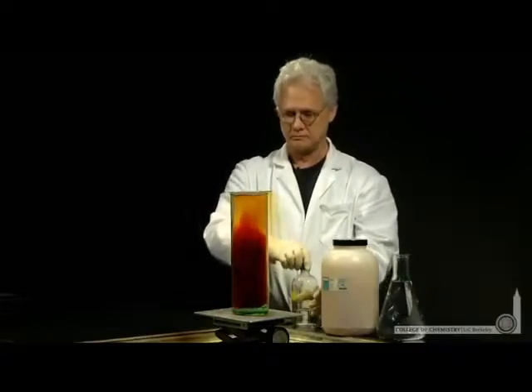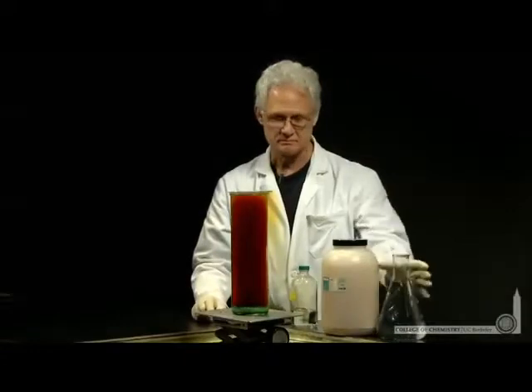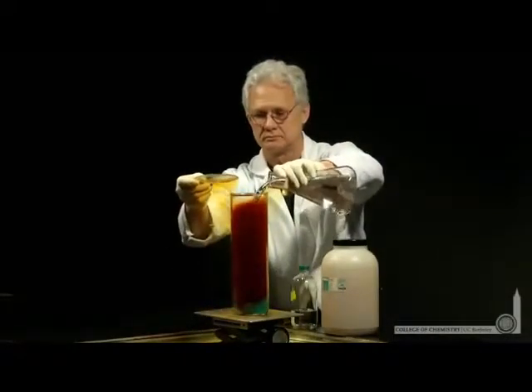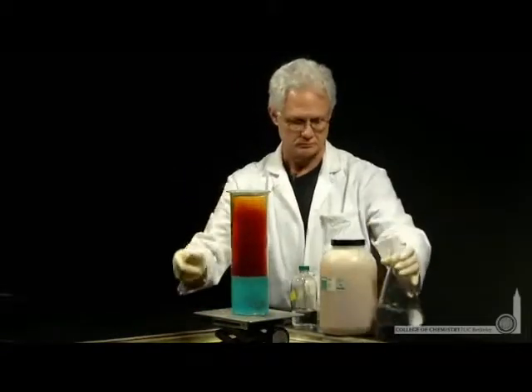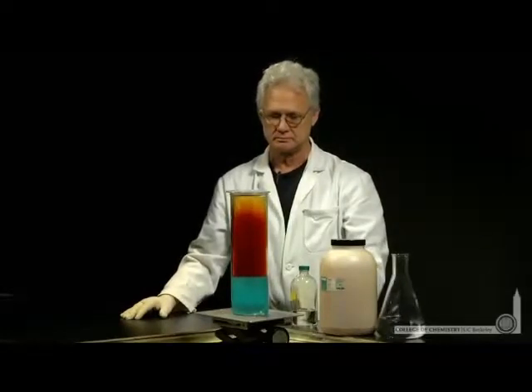copper metal. Now, copper ions, Cu+2, are blue, so Lonnie can add some water to this mixture and we'll see the lovely blue color of the copper ions and the brown gas, NO2, formed above them in this oxidation-reduction reaction.